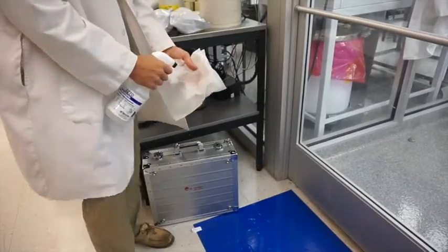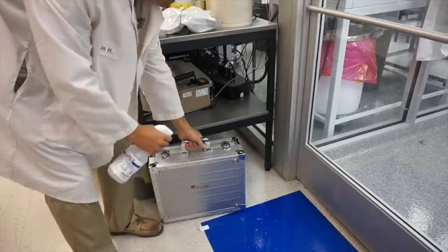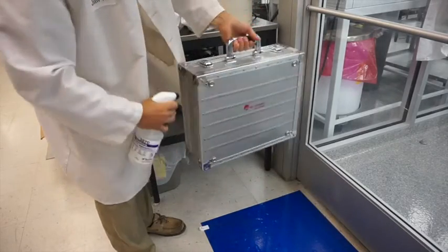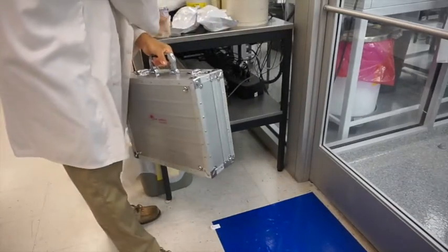Before taking any of the equipment into the clean room you should always wipe down the entire surface of the shipping container with alcohol. It's really important to be aseptic when carrying stuff in and out of a clean room just so you're not cross-contaminating anything.